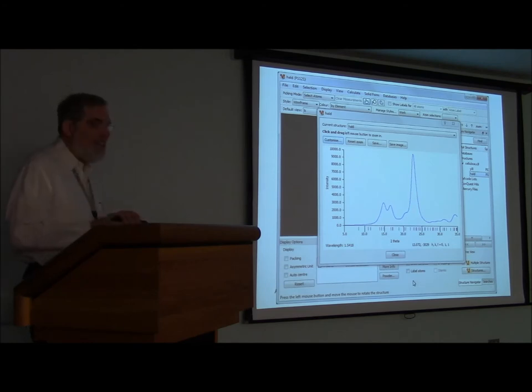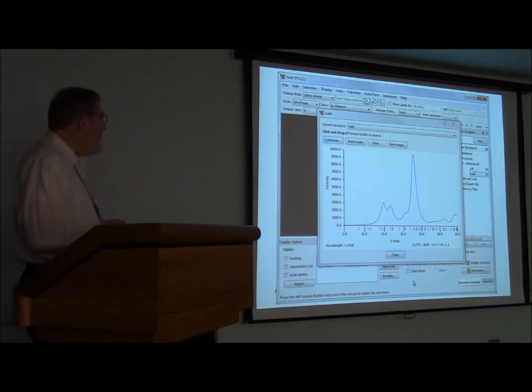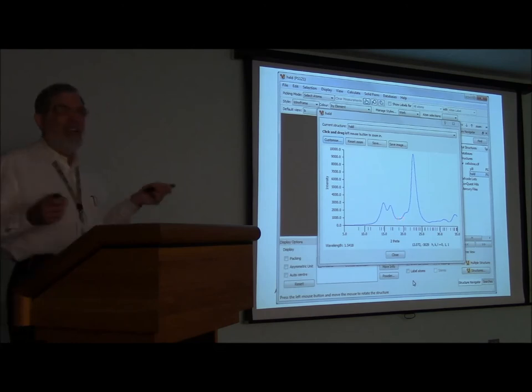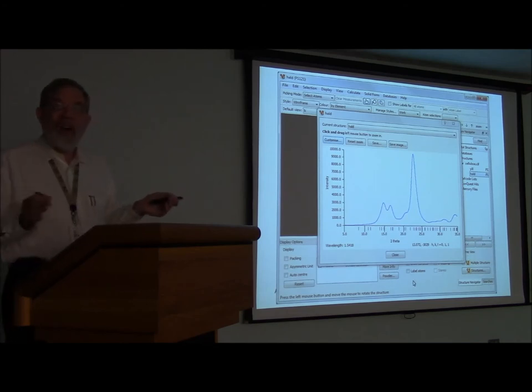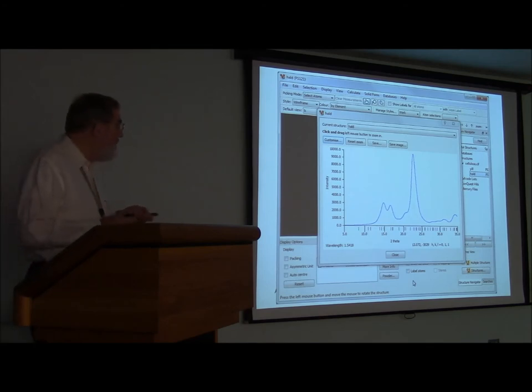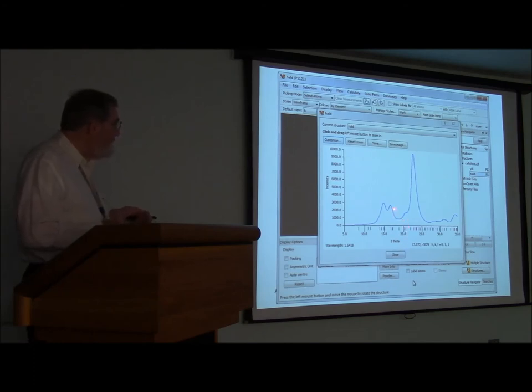And then you can take advantage of that peak width at half height that you put in and say, well, that's what size crystal we have. And so we can understand what we're looking at better. Notice that Segal's value for the amorphous showed up here in this calculated pattern, this material here, which he considered to be amorphous. And that crystal information file that we read in to calculate the diffraction pattern had no information at all about amorphous material. But yet, Segal would have considered this to be only 90% crystalline. So the flaw in his thinking was that these peaks would come down and not overlap enough to create this intensity here in between the larger peaks.